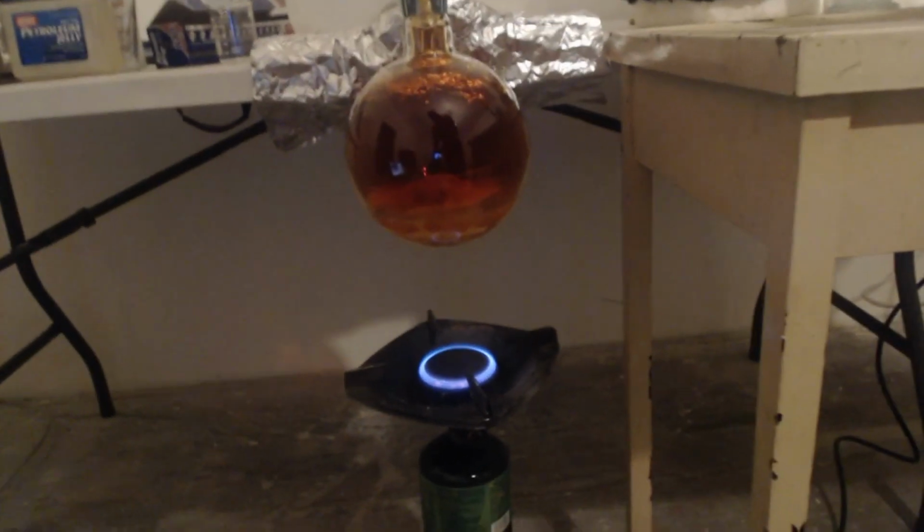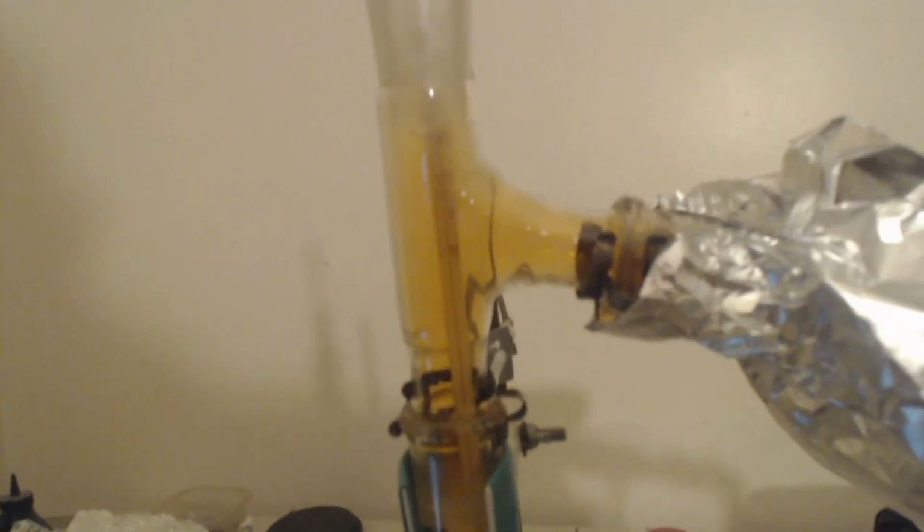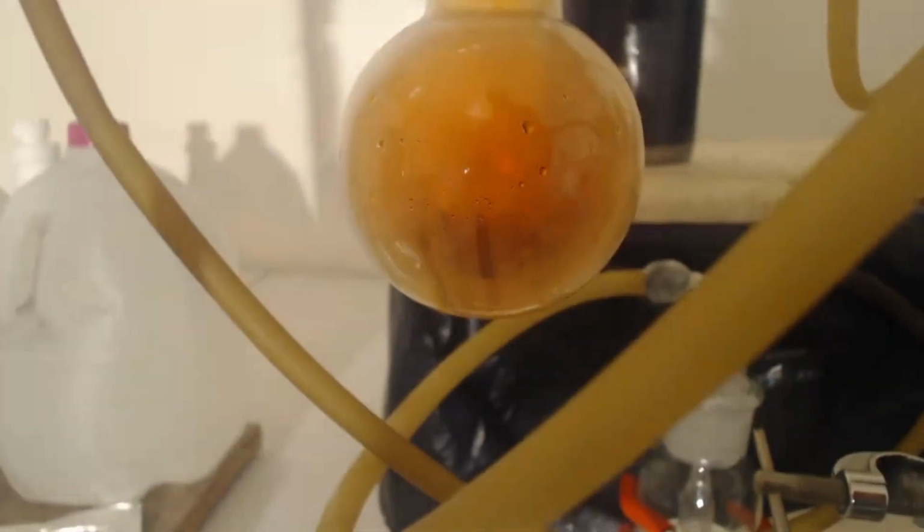You can see it's starting to get up to all the gases coming out. Going all the way up there, it's even getting into the condenser and stuff. So I'll be distilling here in a second. It's 83 degrees I want to hit it at. That gas will subside soon. I mean, it won't be as bad once it starts distilling. There's a receiving flask. You can see it's starting to come over.